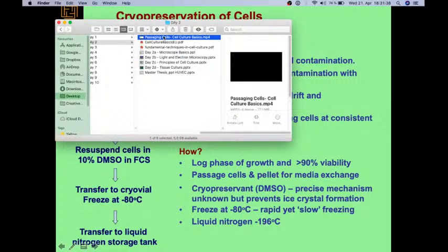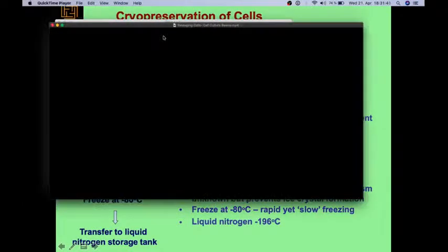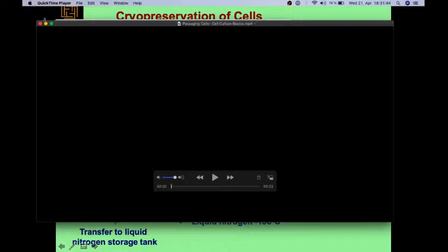So let's watch one video on how we passage cells. It's a 5-minute video.